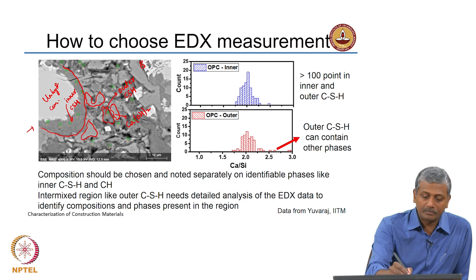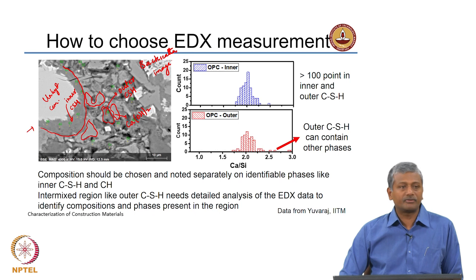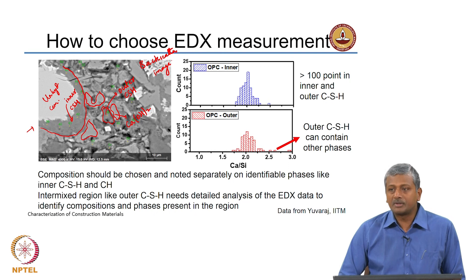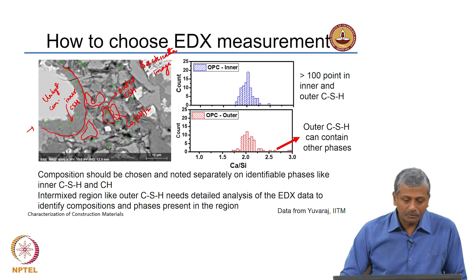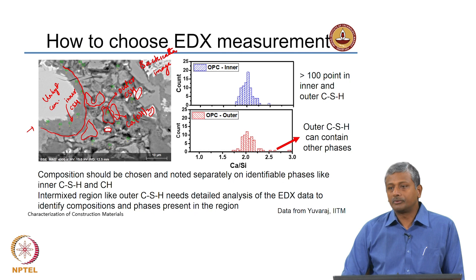This is a backscattered electron image. Unhydrated cement grains have a high density because they have no voids or pores within their structure, whereas calcium silicate hydrate has a lot of internal porosity, making it a less dense phase. So unhydrated grains appear the brightest. Among the cementitious phases — C3S, C2S, C3A, and C4AF — C4AF will look the brightest because it contains iron, giving it higher density and maximum reflectivity. So almost perfectly white spots could be from unhydrated iron-bearing compounds like C4AF. There are different shades of grey observable in this backscattered image.